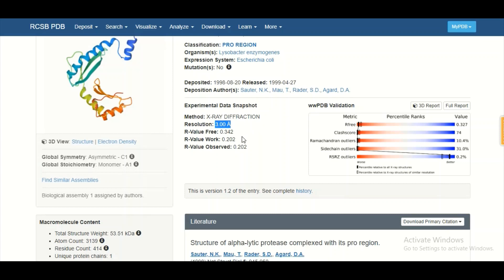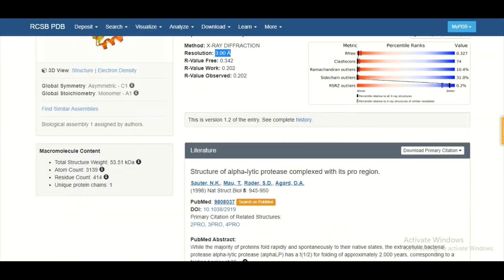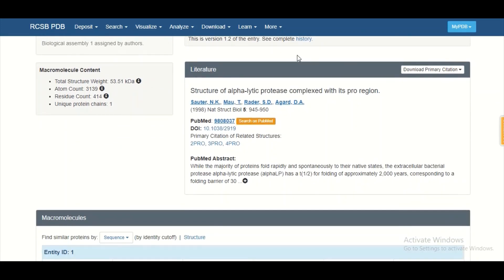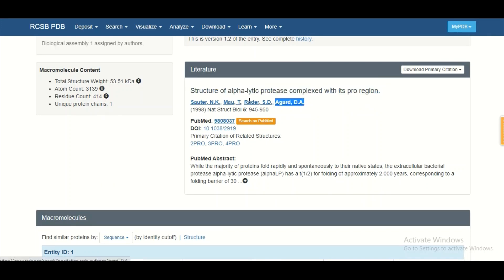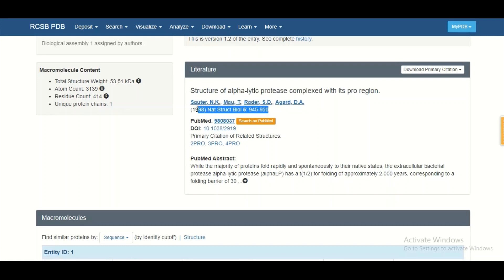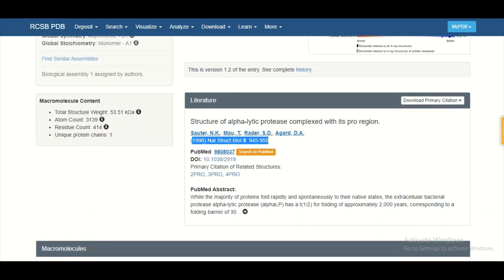R-value free, R-value work, and R-value observed are typical experimental details we are not going to cover in this session. You can also find information about the literature associated with your protein structure, including the manuscript title, author names, journal, date, volume, pages, PubMed ID, DOI number, and abstract — all available in the literature section.